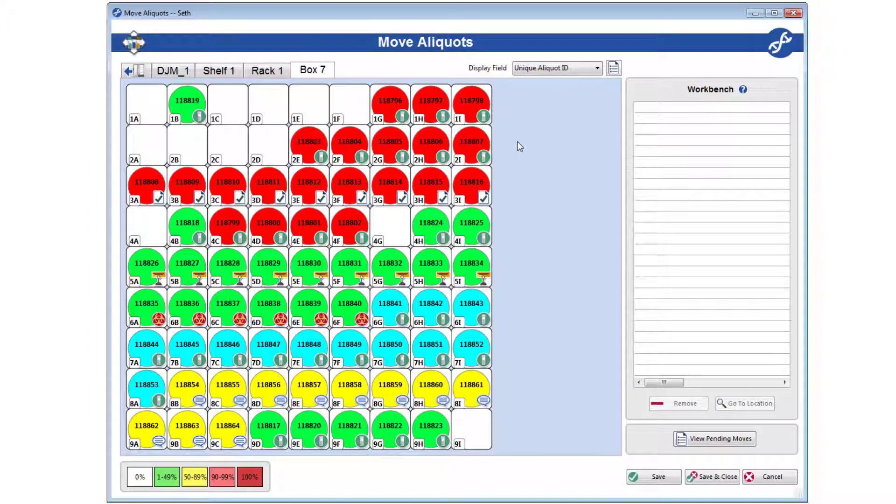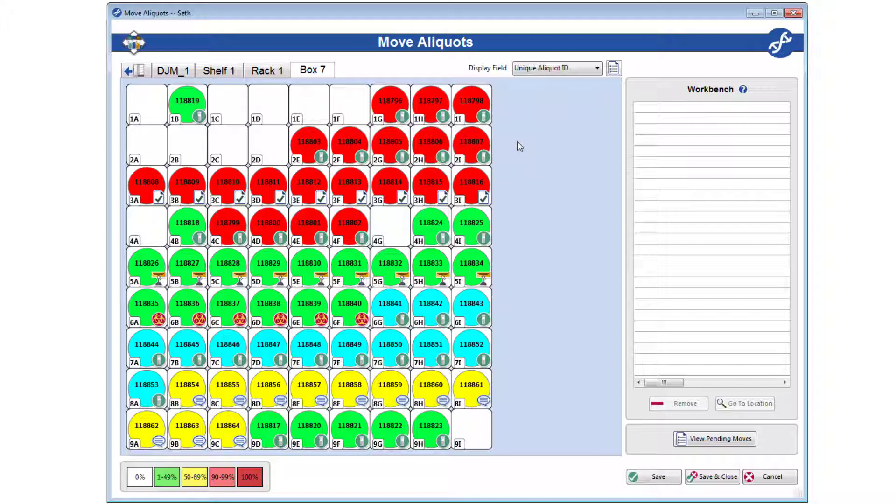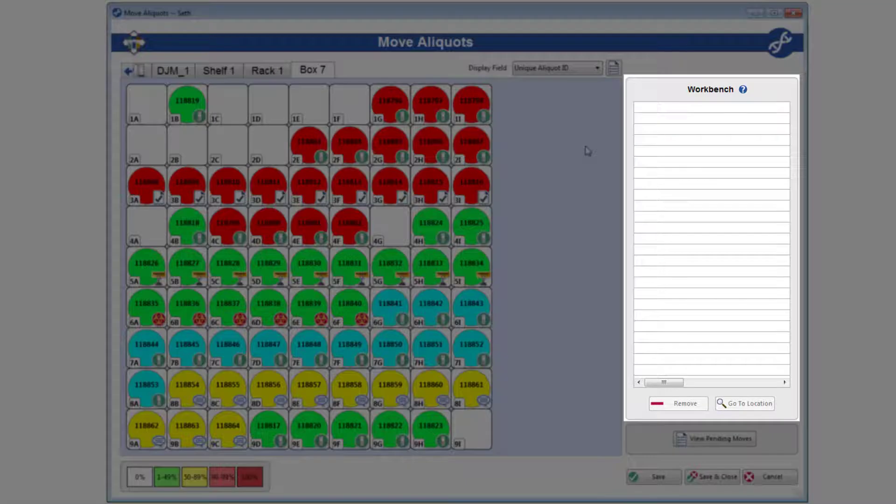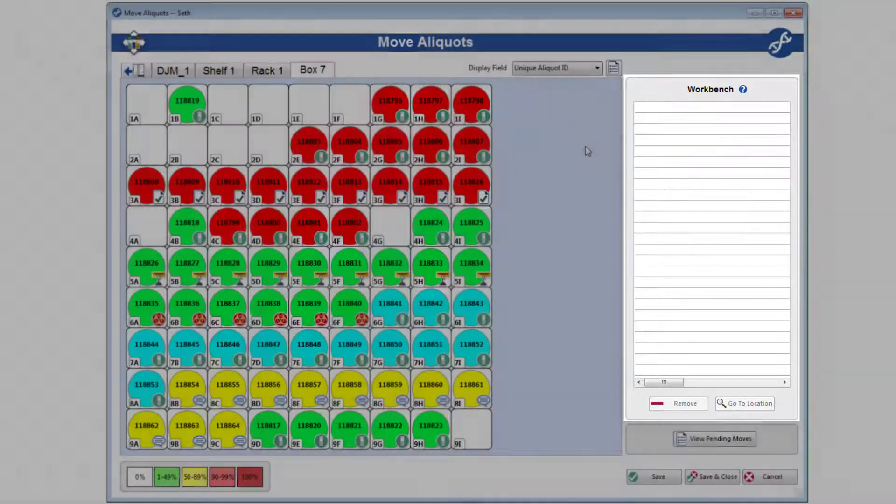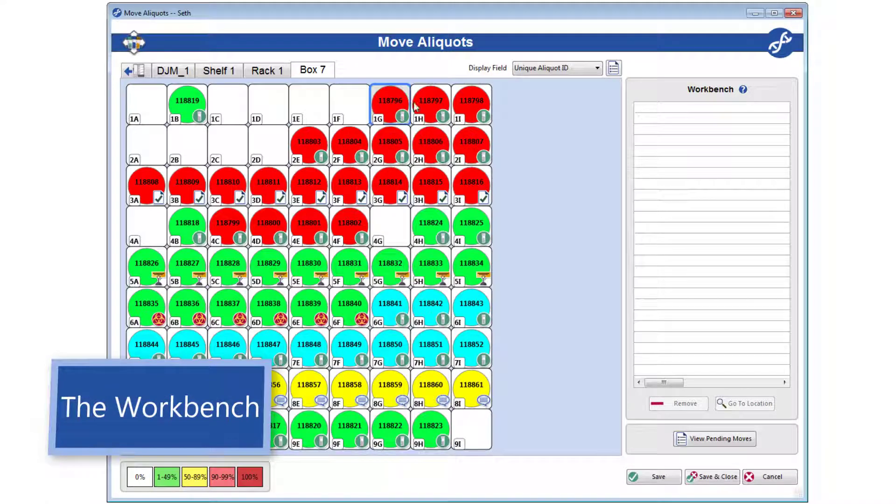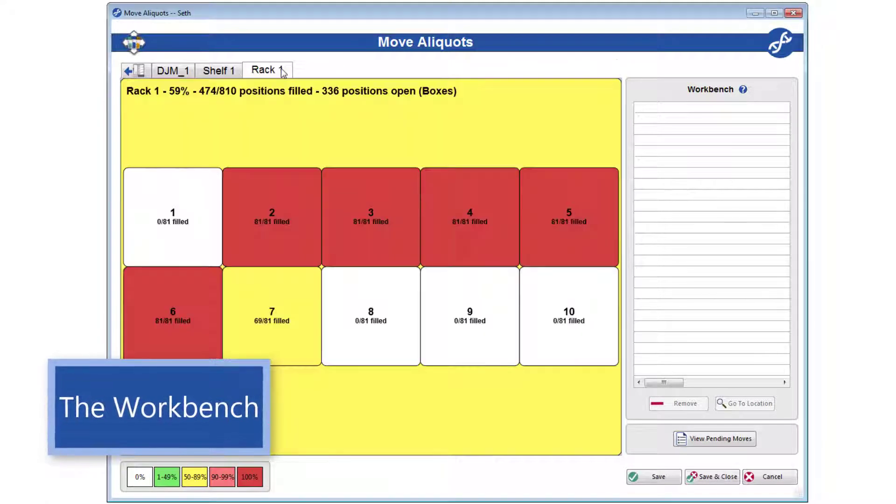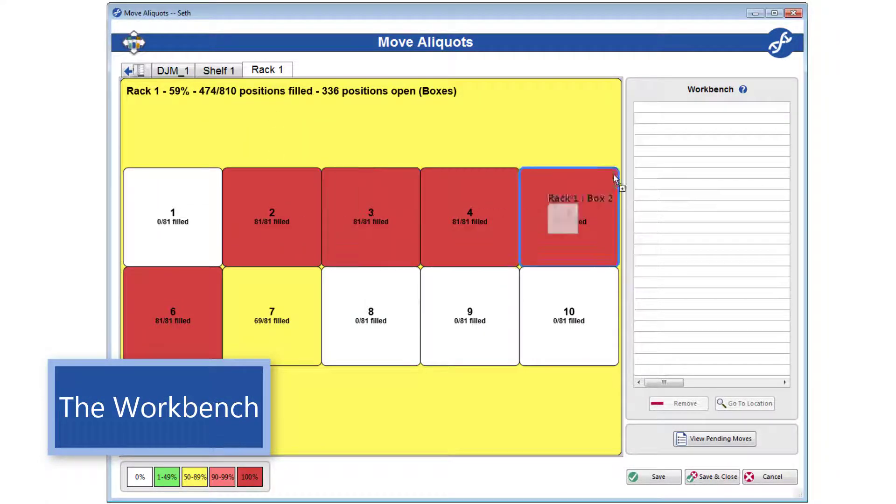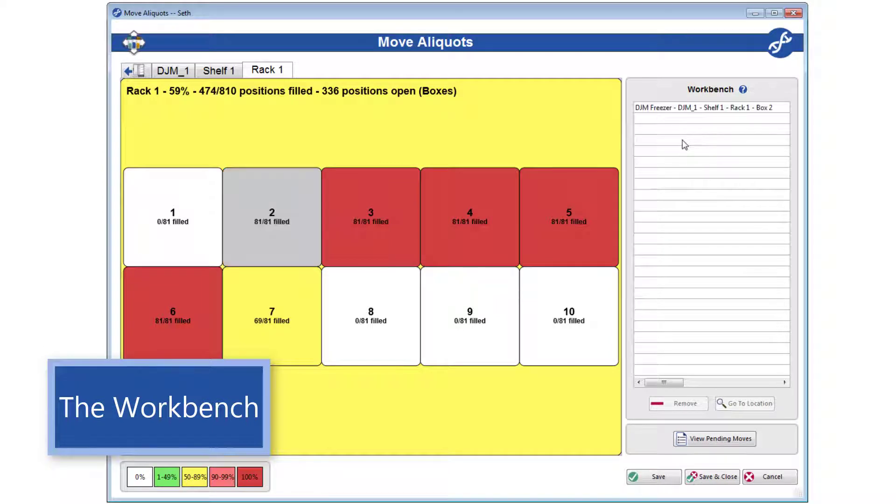Most of the time, however, I imagine you'll need to move something outside of the currently open subdivision, probably to a different freezer entirely. This is the second type of move, and it involves the workbench. Think of the workbench like a staging or holding area for moves. Drag a subdivision or some aliquots here, and a line representing whatever you just dragged will be added to the workbench list.